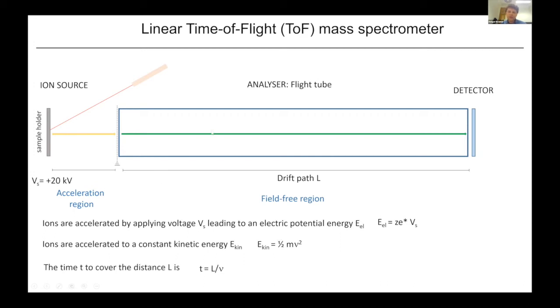However, that implies that ions of a lower mass should be faster, and ions of a greater mass should be slower as they fly down this time-of-flight tube. Ultimately, when we take the different equations together, if we have determined the time of flight, the only thing that's unknown to us in this experiment is the mass-to-charge ratio, or m/z value, which can be worked out in the experiment.